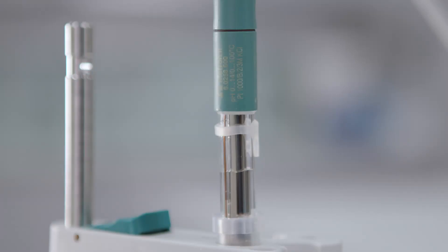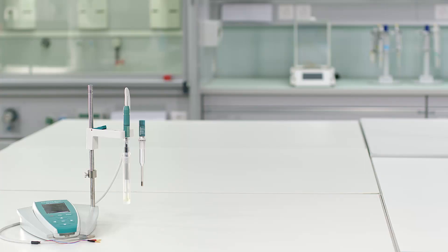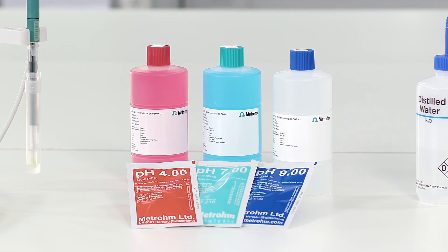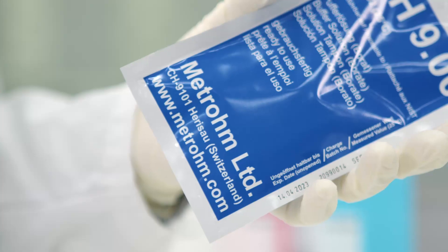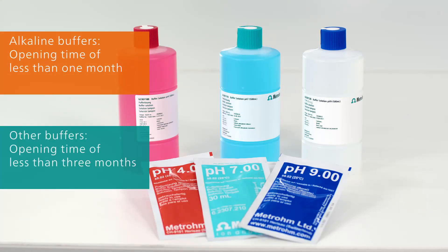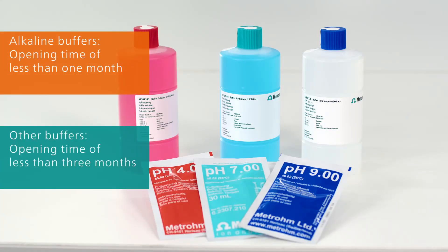For the calibration, you need your instrument, the pH electrode, an integrated or separate temperature sensor, certified buffers, and deionized water for rinsing. Only use fresh buffers for the calibration. The use of sachets ensures that the buffers are always fresh. Make sure that the buffers are not expired. Additionally, if you use bottles, ensure that the recommended opening period is not exceeded. This is especially important for alkaline buffers with a pH value higher than 9, because such buffers take up CO2.